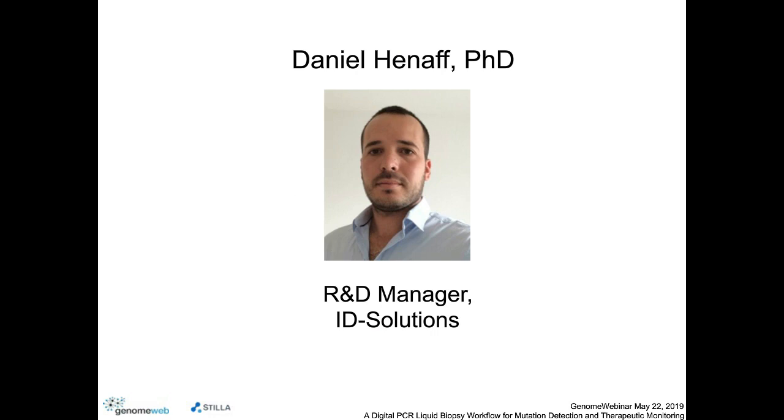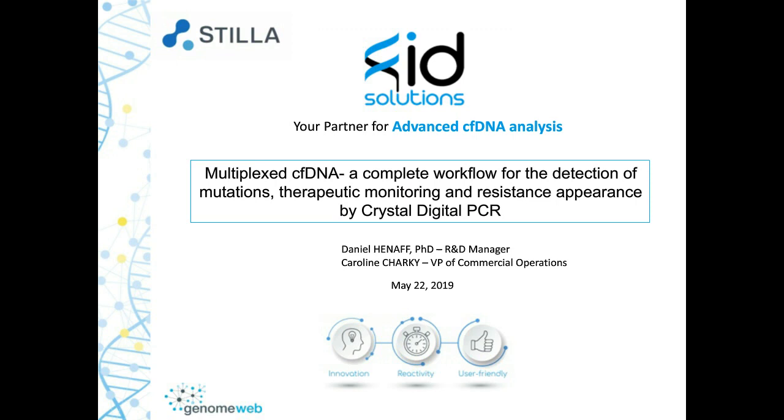Hi. So good morning, everyone. So basically what I will talk to you today is how digital PCR can be a powerful tool in the management of patients with cancer, especially with liquid biopsy, but not only. So the idea is to focus on the multiplexed, the complete workflow, and monitoring. I will try to detail what we mean when we talk about complete workflow, why multiplexed is important, and how we can enhance diagnostics with the Naica platforms.